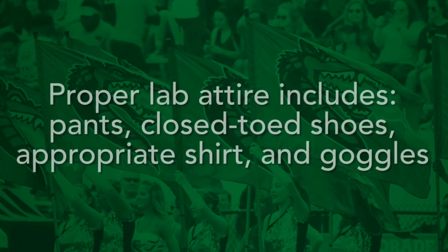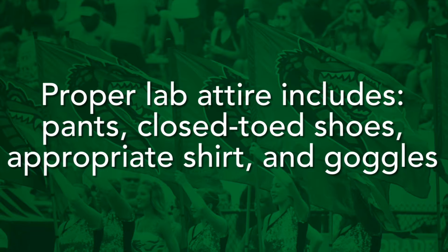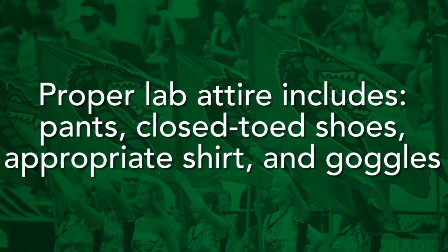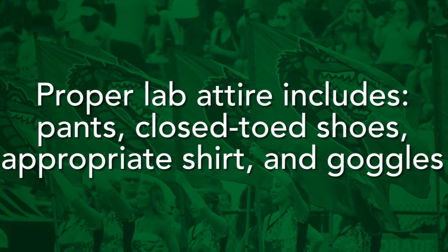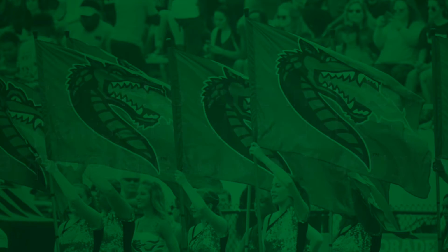But before we can begin our experiment, we need to ensure that every lab member is wearing appropriate lab attire. Make sure everybody has on long pants, closed-toed shoes, and a shirt that properly covers their upper body. And don't forget to always wear your safety goggles.